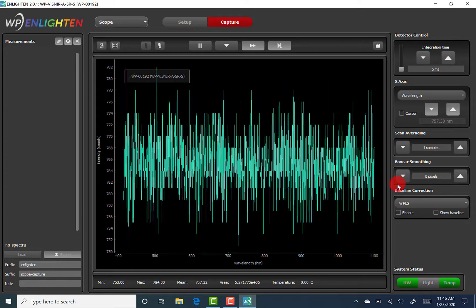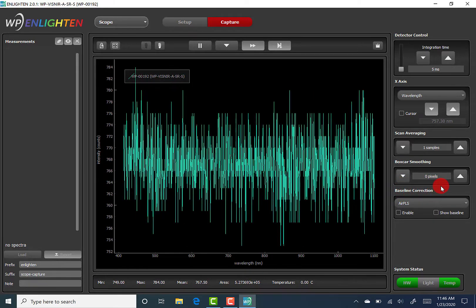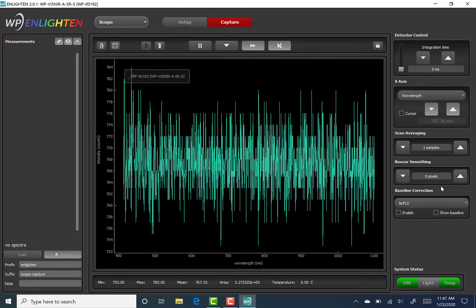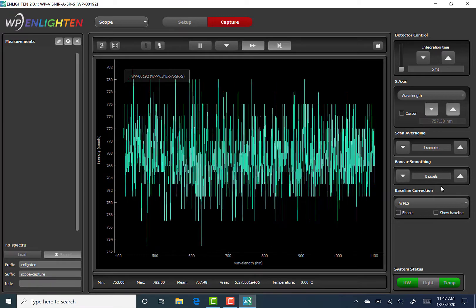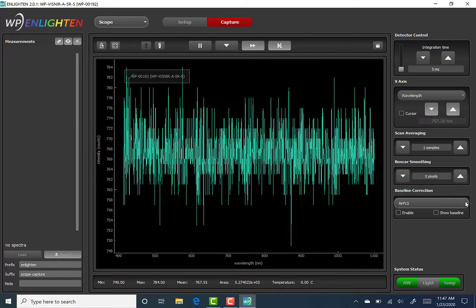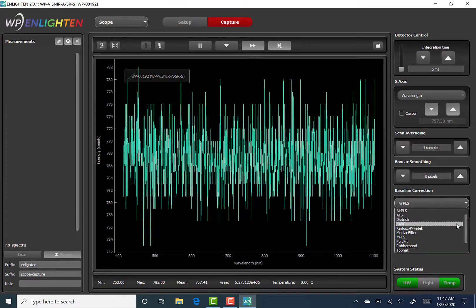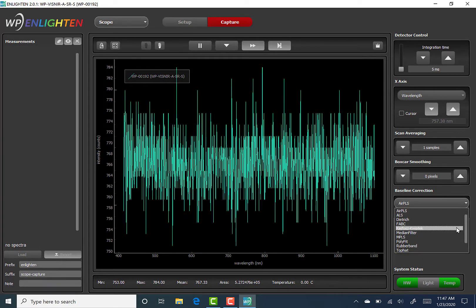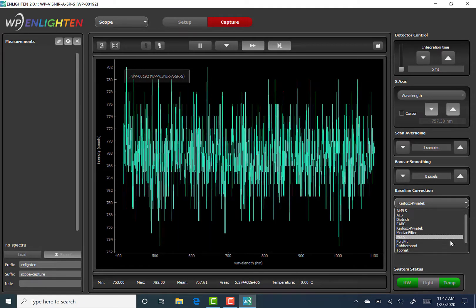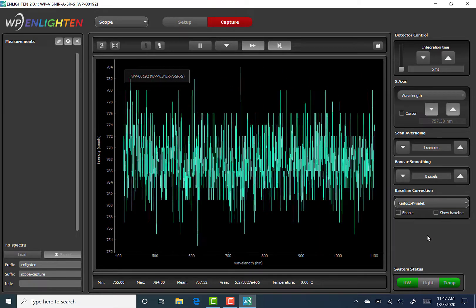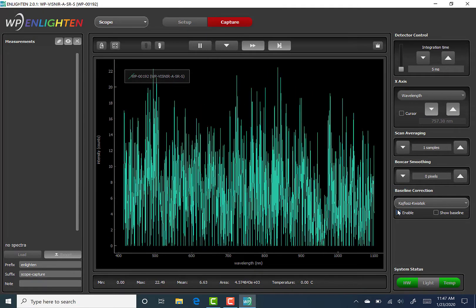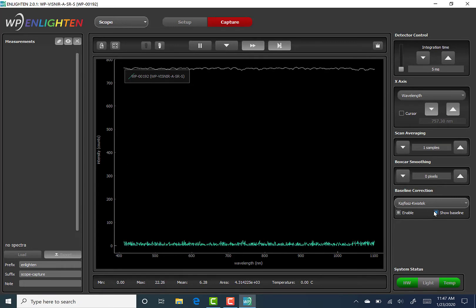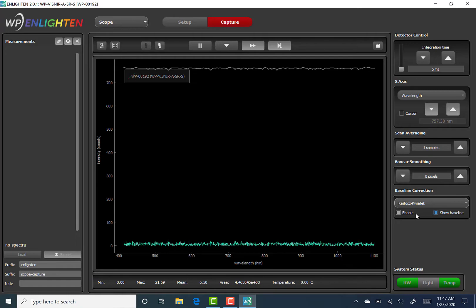The baseline correction feature can be used to remove a majority of broad-band baseline spectral features, so that the detailed spectral features of the desired measurement are more prominent. The pull-down menu offers baseline correction methods such as AirPLS, ALS, Dietrich, FABC, Kajfosz-Kwiatek, Median Filter, MPLS, Polyfit, Rubberband, Top Hat, and Wavelet. Enable this feature by clicking inside the box shown here. Click inside the box for show baseline to visualize the features that are being removed from the processed measurement as a spectral overlay within the spectrum chart.